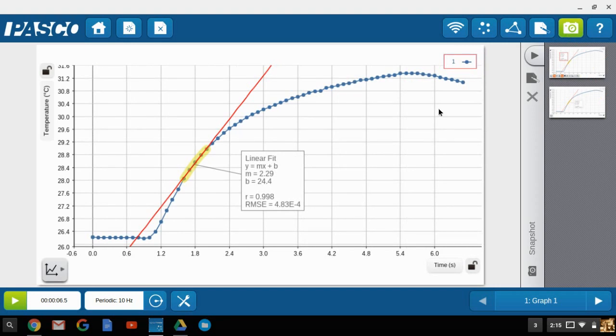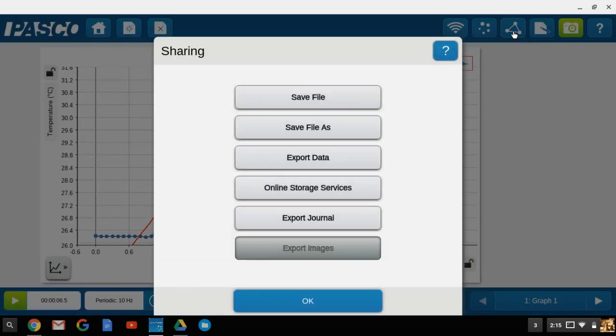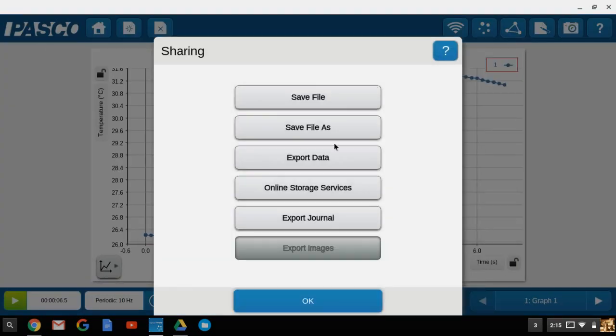To export the journal, go ahead and select the share button at the top, and then go down and select the export journal at the bottom. The exported journal will be exported into a zipped file that contains both the images and the HTML file information to display it within a web page. So we'll click on export journal.